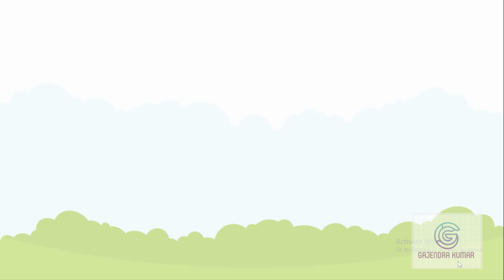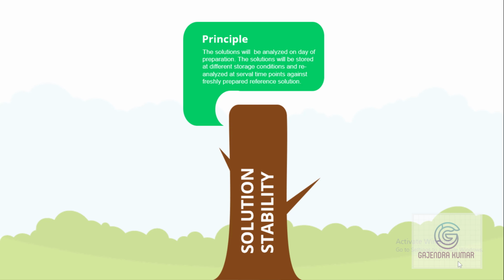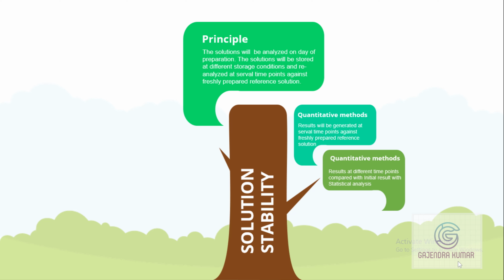Let us start our discussion on solution stability. In solution stability, the solutions will be analyzed on the day of preparation, stored under different storage conditions, and reanalyzed at several time points against freshly prepared reference solutions. In case of quantitative methods, the results will be generated at several time points against freshly prepared reference solution, and these results are compared with initial results by performing statistical analysis.